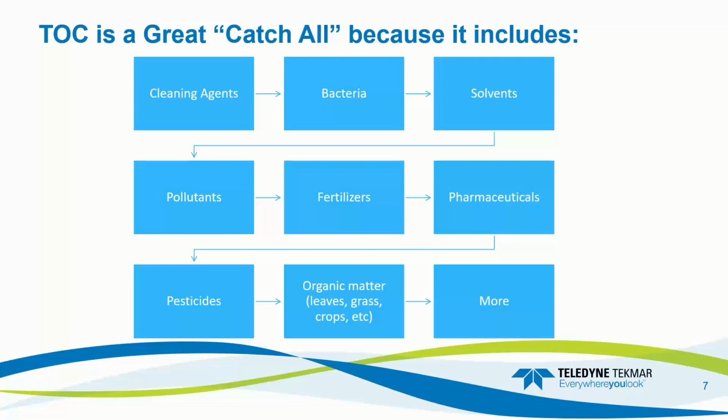It'll take the carbon in that sample as we send it through certain oxidation processes, converts it over to CO2 for measurement, and we get one lump sum value instead of having specific unknowns that we have to trace down through analytical methods and analytical standards. TOC provides a great catch-all, one interpretation for what the water is like.